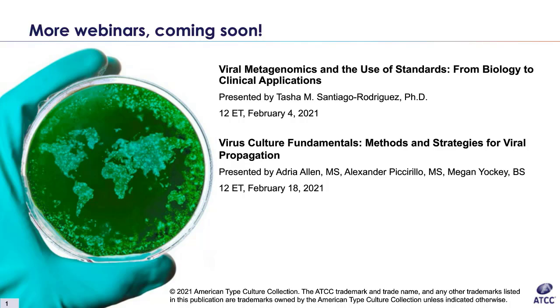So most liquid nitrogen tanks should come with some sort of documentation saying like 20 gallons for this size tank. Companies that come and refill liquid nitrogen tanks will generally have an idea of how much you would need for your purposes. They definitely see a lot of biological liquid nitrogen tanks. It's definitely something they would be fairly familiar with.